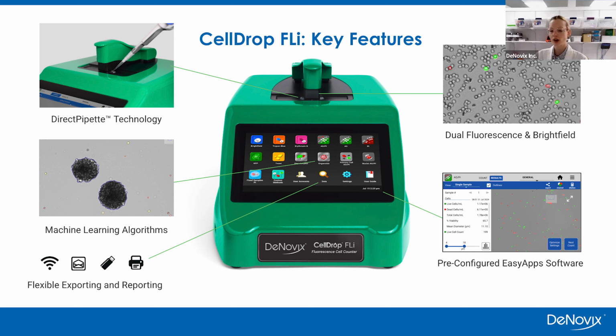So this allows for a wide range of assays, applications, and sample types that we are compatible with. Most recently, we have been diving into machine learning apps, such as the Organoid app. And all of the data is reported with an easy-to-use software, and you'll see the speed and ease of use when we go through our demo together. Not only that, but the device comes with preloaded apps, free software updates with new added features and applications, and we have multiple exporting options.